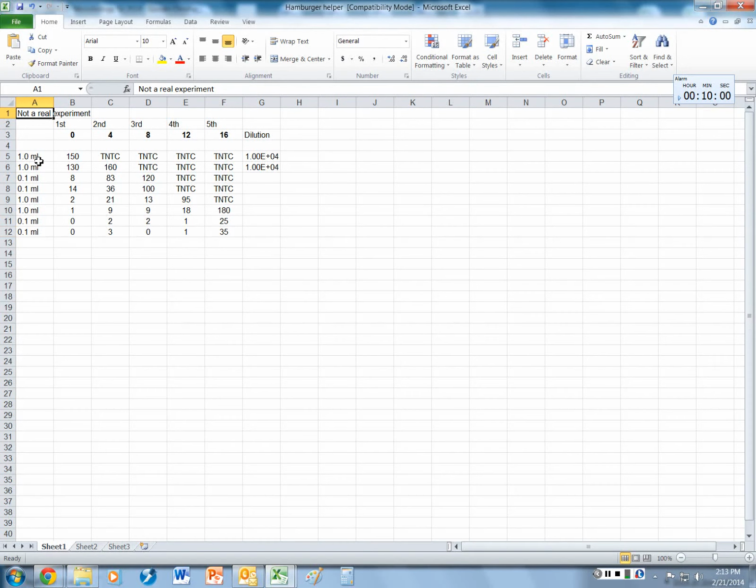Well, if you notice, by looking at these, this is 1 mil, and this is 0.1 mil, 1 mil, 0.1 mil, just sort of like yours. Now, these two here are 10 times less than this. So you can do this, or you can just write things in by yourself if you want. But this is what I like to do. Just saves me a minute.